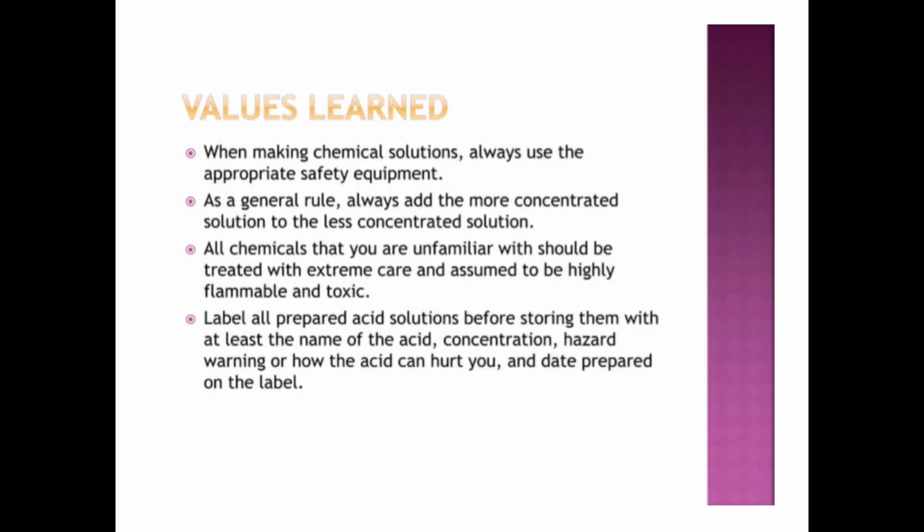Now, let's look at some of the values that we've learned. When you are making chemical solutions, always use the appropriate safety equipment. It is very important. The next one is that, as a general rule, you must always add the more concentrated solution to the less concentrated solution.